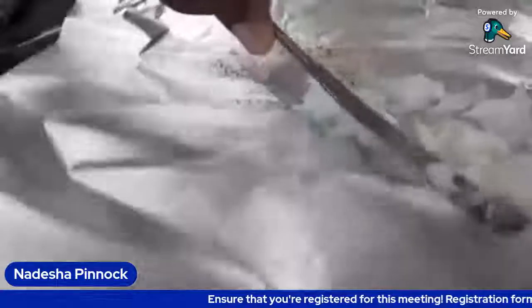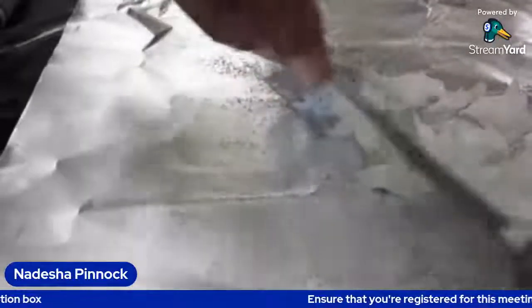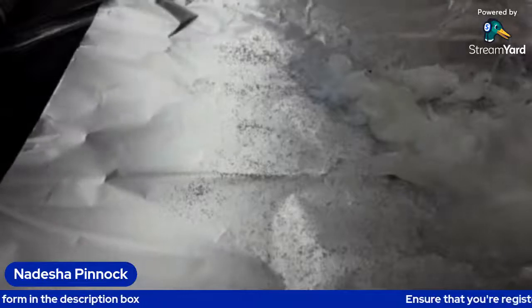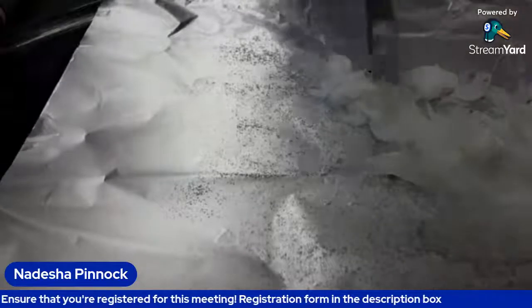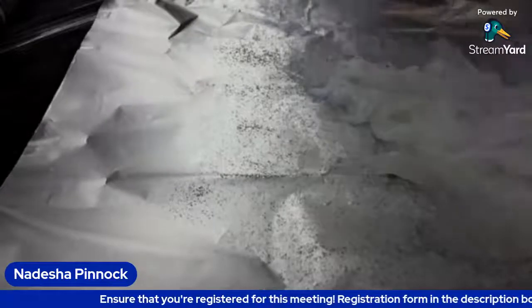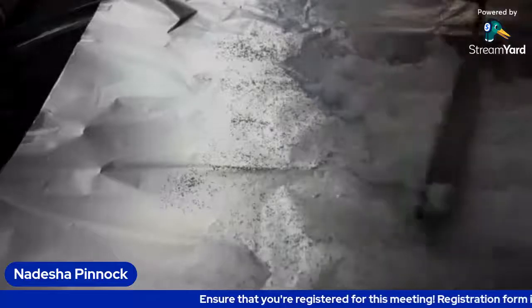Going to spread it out so it dries easier. Well, probably when it's dry, it will lower the volume. So this should be less opaque. You feel here, so less opaque? It should be.